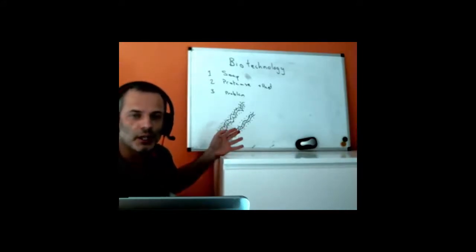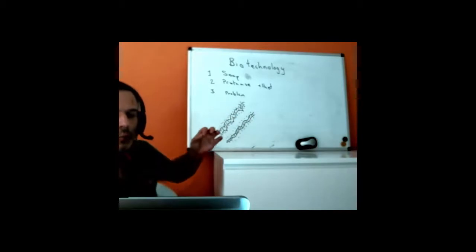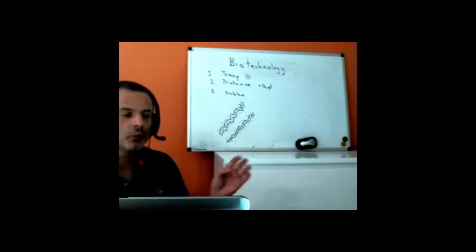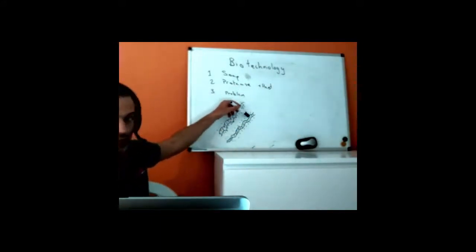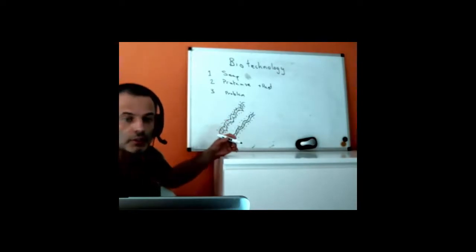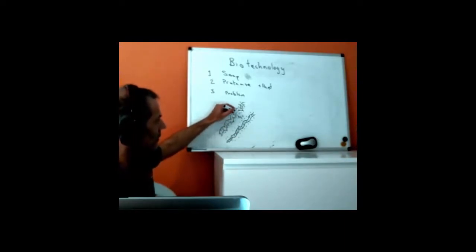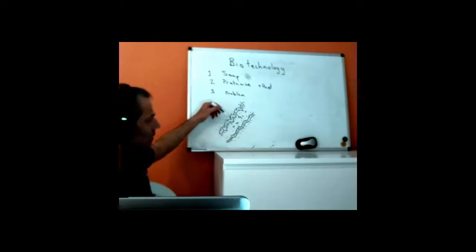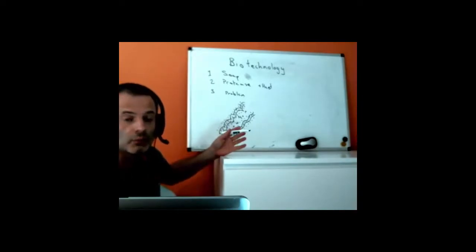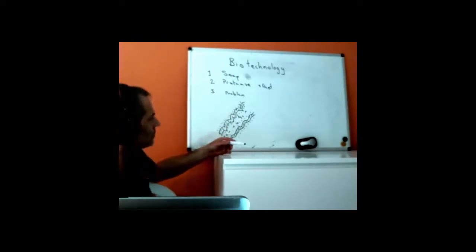Now we need to turn to chemistry again. So from chemistry, what we know is this is going to be really soluble in water, but if we change it to another solvent that is not as polar, it won't be as soluble. However, we're going to need some positive ions to go in between this gap, otherwise it will never crystallize. So what can we do? We can increase the salt concentration. If we increase the salt concentration, let's say sodium chloride, so let's have some Na+ ions in between, then we can stack these plus minus, and that is then allowed. It will retain quite a lot of water, but that will still allow us to separate this with water in it from all the proteins and other stuff in the cell.